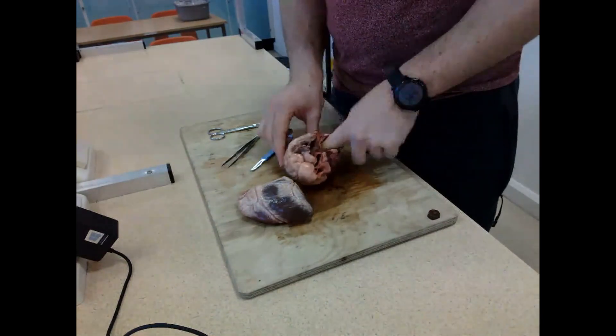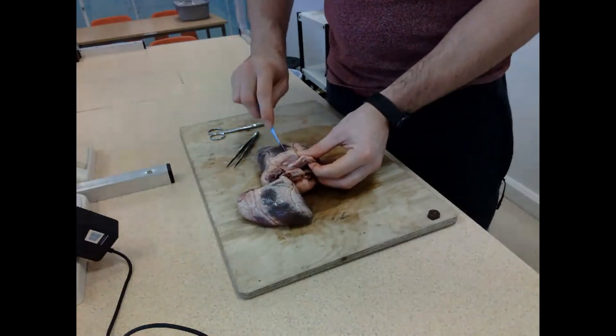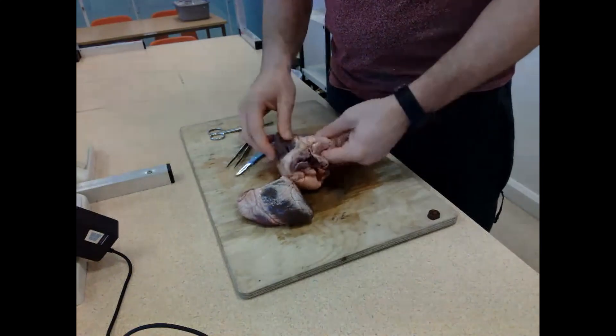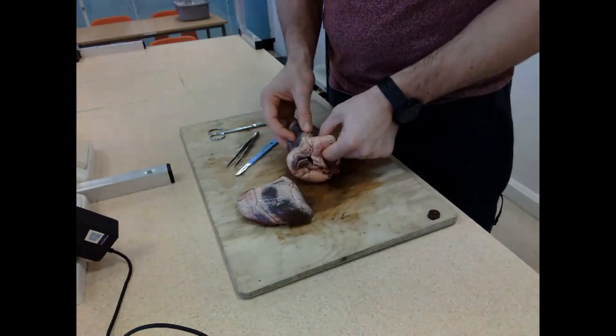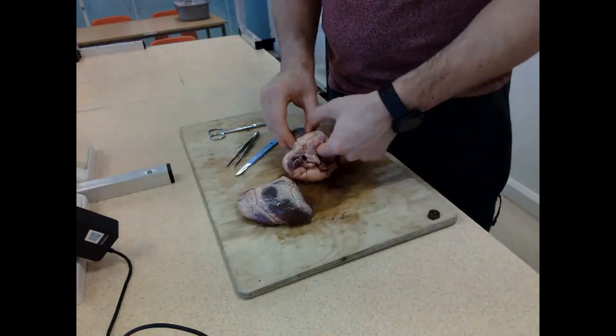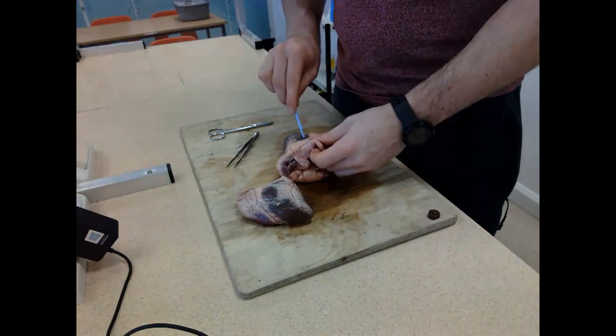Now going to the left hand side - doing the same thing, identifying where the atrium is, making my short cuts there. I'm happy that's the left atrium. I'll then go down and cut into the left ventricle, which allows me to identify the internal structures of the heart on the left side.